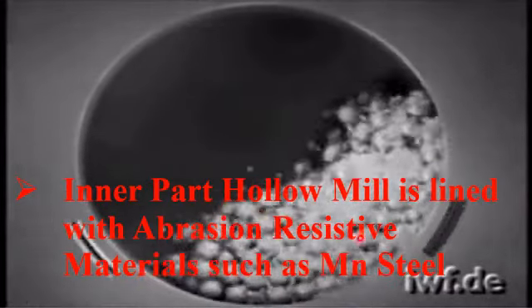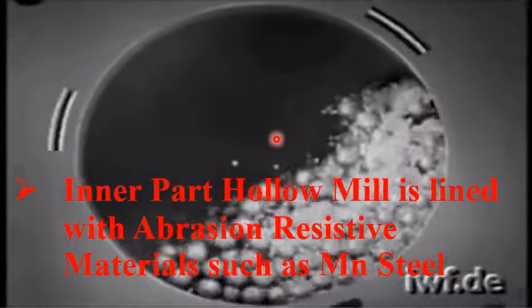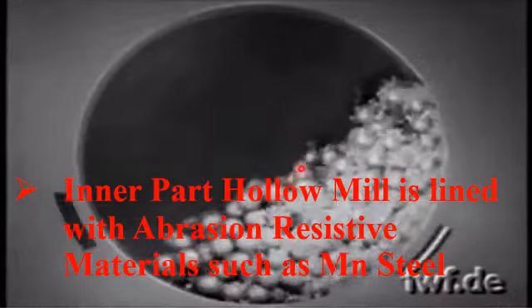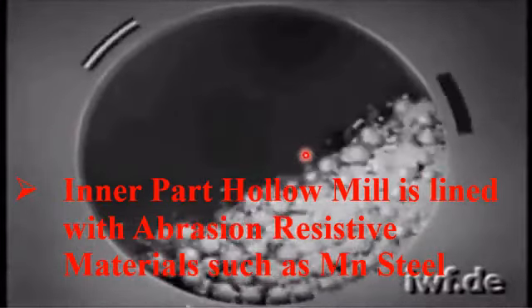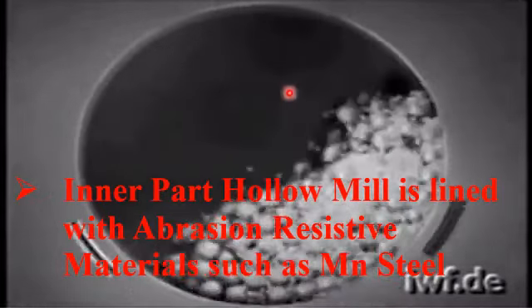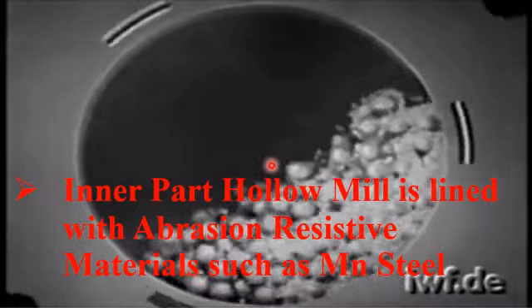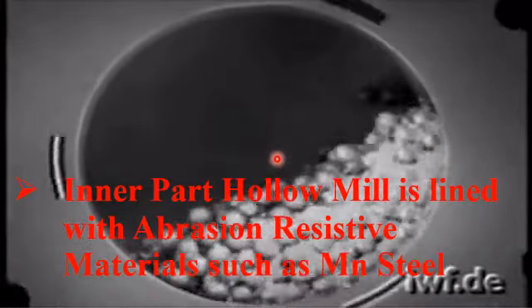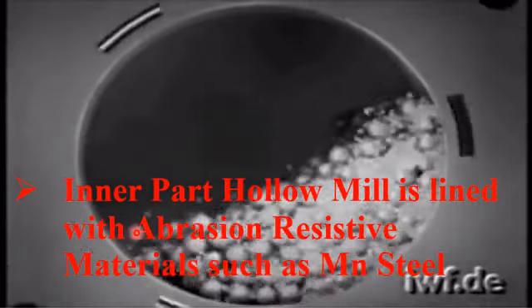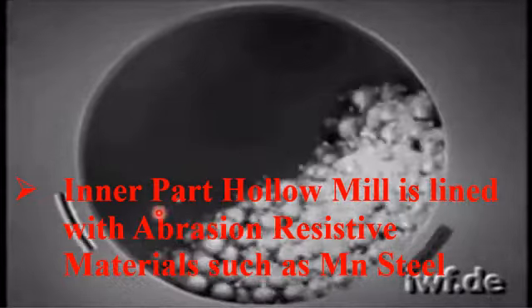So when the bulk material which we want to crush and the balls interact with the abrasion resistant material, they will never peel off from the surface of the drum, and they will never be incorporated into the nano powder. In this way we get a highly pure material. Due to this, the abrasion resistant coating is very important in ball milling apparatus.